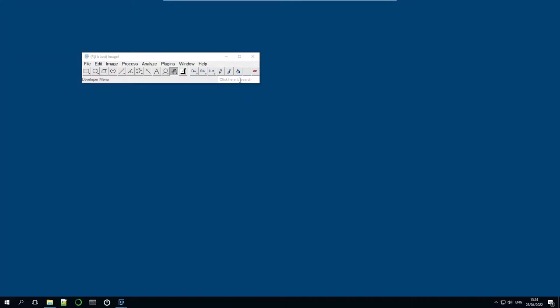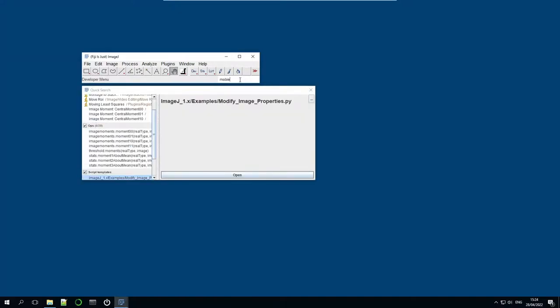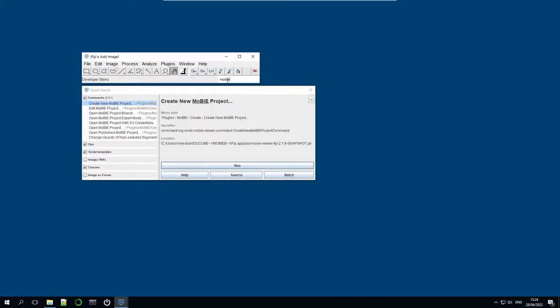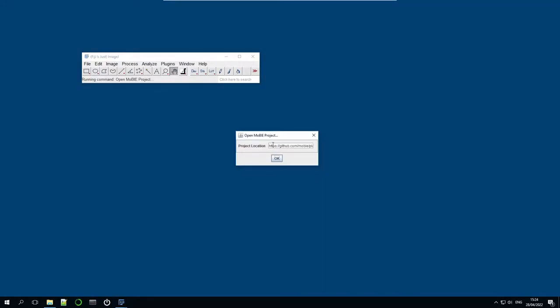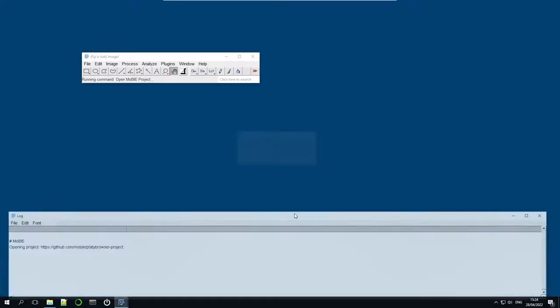Okay, so first we have to open up MoBIE. We can do that by typing MoBIE into the search bar and finding this open MoBIE project command. Then we have to give the project location, so in this case the location of this Platy browser project, and click OK.